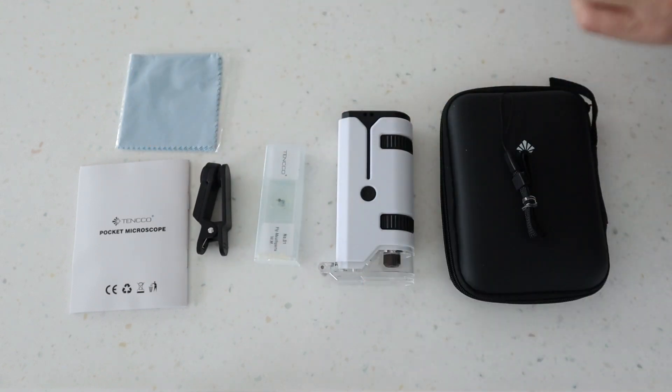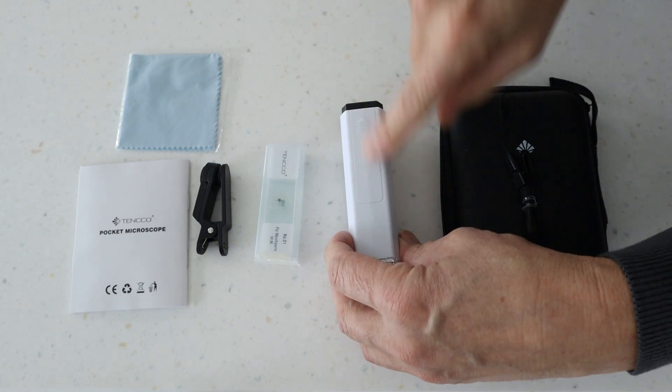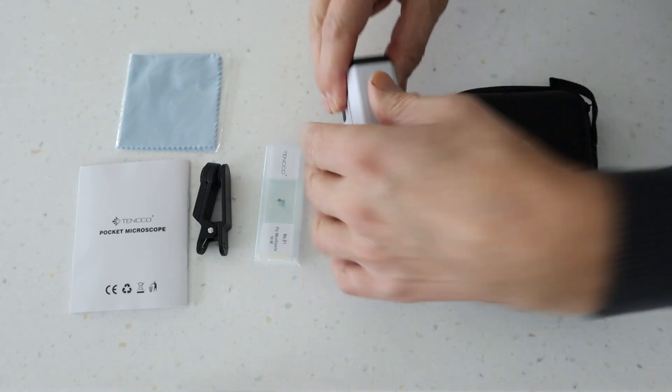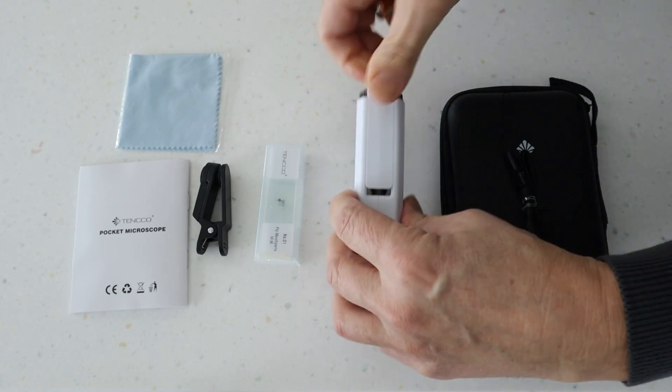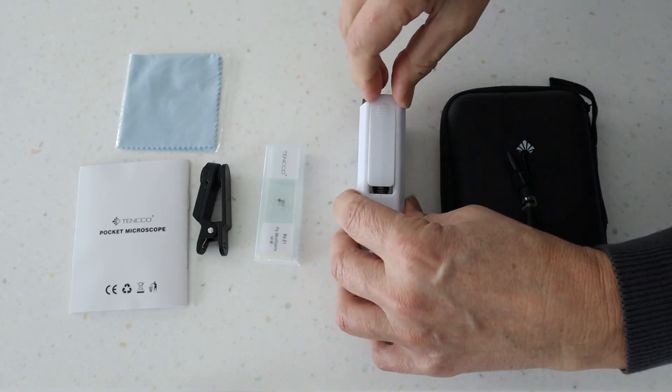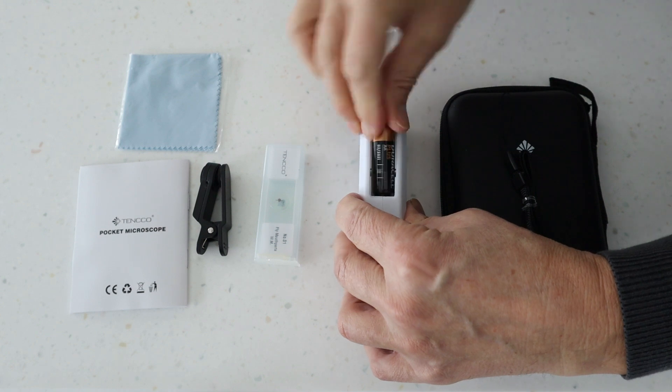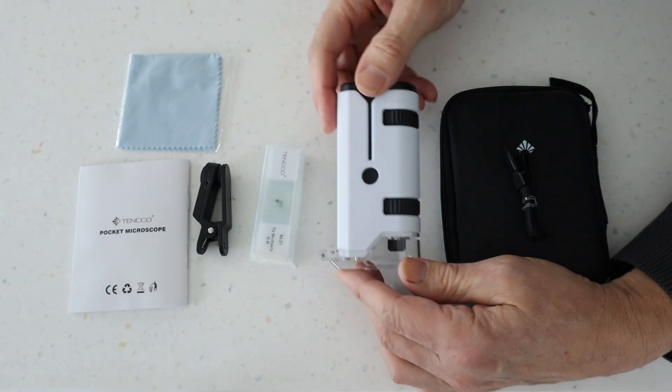In terms of what you need: this doesn't come supplied with batteries. On the back of the microscope you have a little slot and it takes one AA battery. I'm going to pop that in now so I can show you the different lights it has. So let's just put that battery in — okay, that's our battery in.